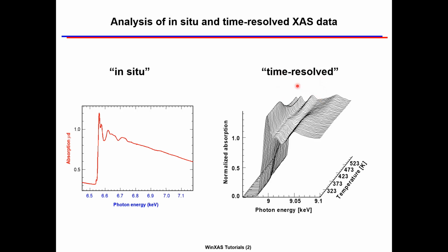Time-resolved experiments, regardless of conditions, yield a series of spectra ranging from a few 10 to several hundreds. While it may be possible to analyze all spectra individually step by step, this would be rather time-consuming and inefficient. Additionally, more often than not, we analyze such series of spectra to reveal characteristic evolutions of parameters with time rather than absolute values. This requires all spectra to be treated exactly the same, which in turn calls for some sort of automated analysis procedure. This procedure should be flexible and permit using any of the previously mentioned data analysis steps.